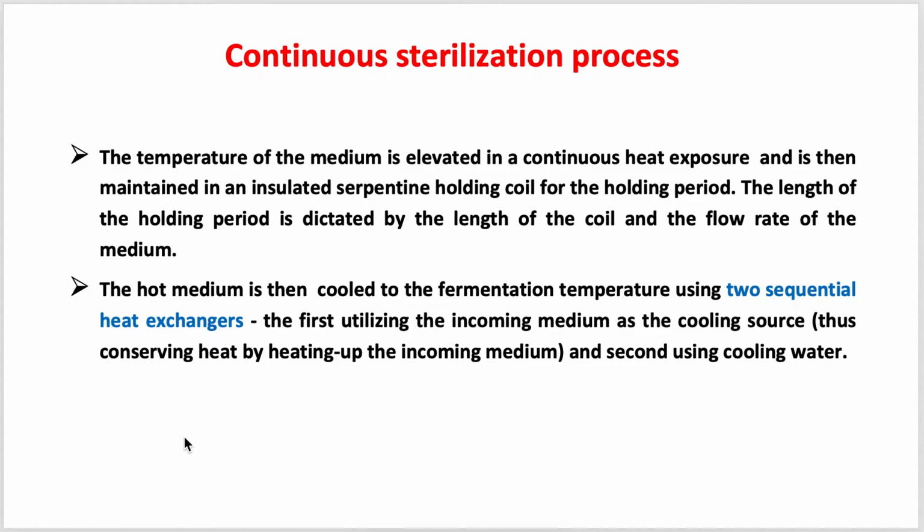So it serves two purposes. The incoming cold media gets preheated by the already heated media, so it will be a cost effective, cost efficient method. So this was one heat exchanger. In another heat exchanger, cold water is used to cool down the heated sterile media.